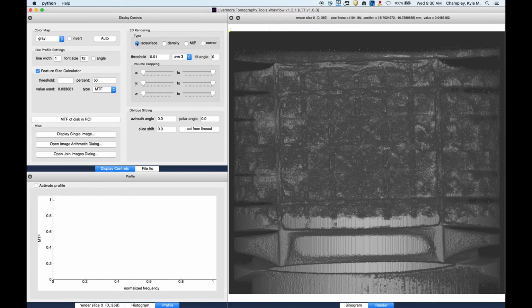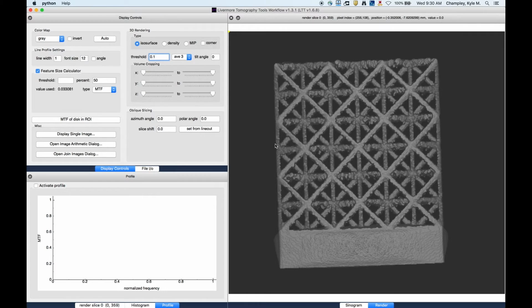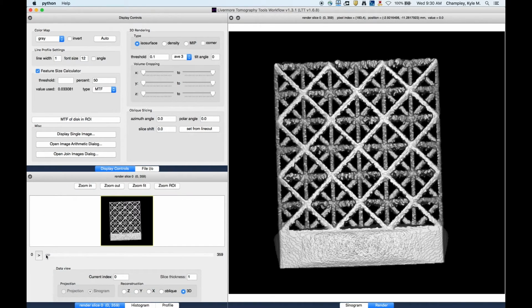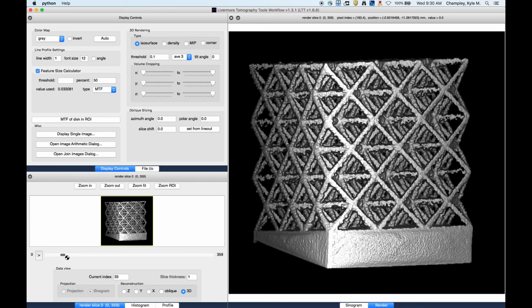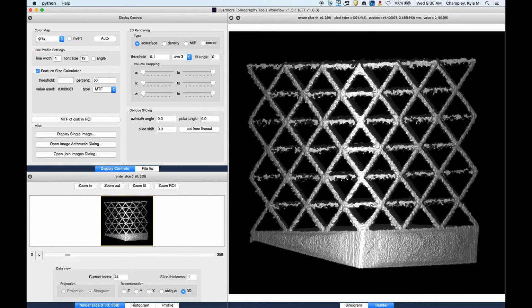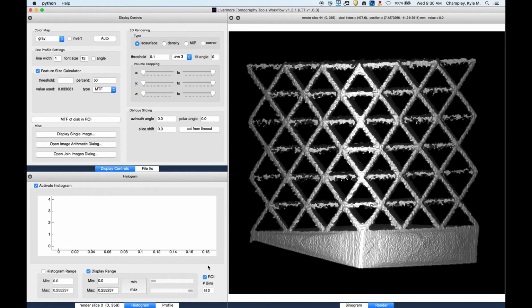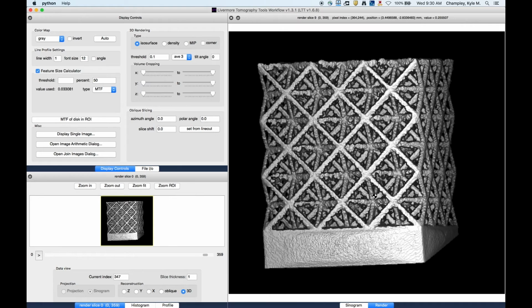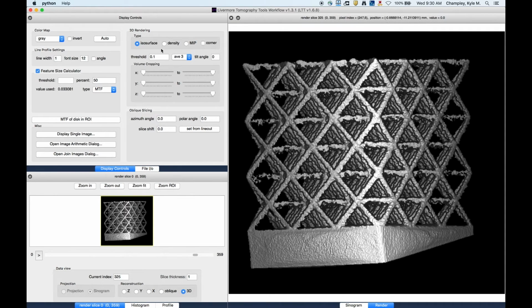This is an isosurface rendering. I can change the threshold here. This is a better threshold. I'm going to do the Control A, or the auto button, so we get a better display. And let's rotate this around. So you can rotate with the slider. Also in newer versions of the GUI, if you turn off the region of interest in the line, you can click and drag it. Anyway, so this is an isosurface.